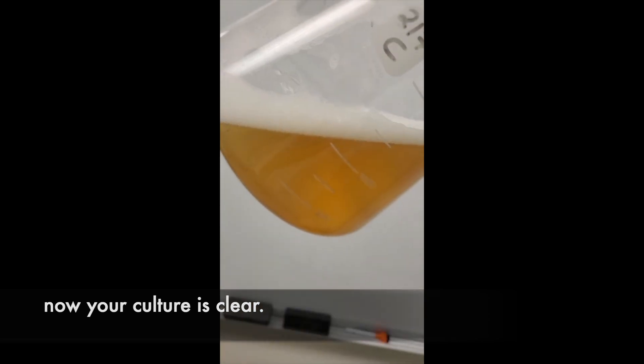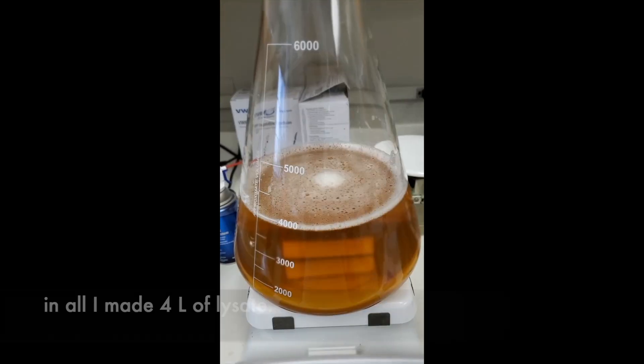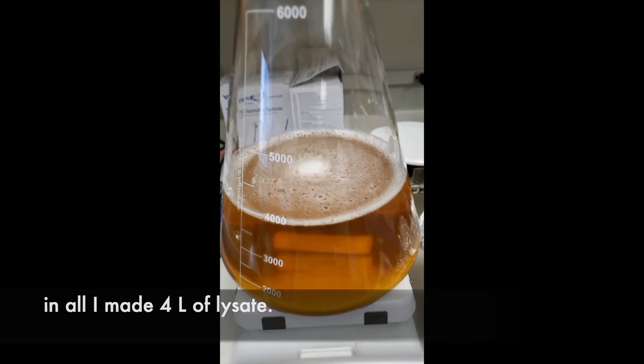Now your culture is clear. You could add chloroform and clear it up even more. In all, I made 4 liters of lysate.